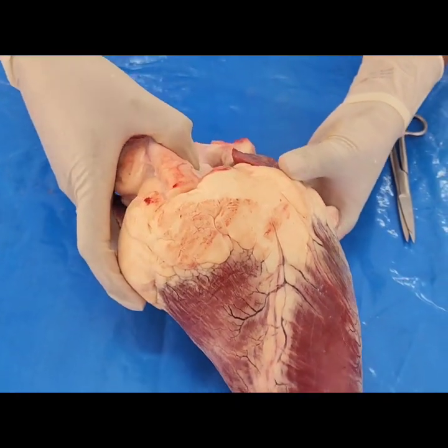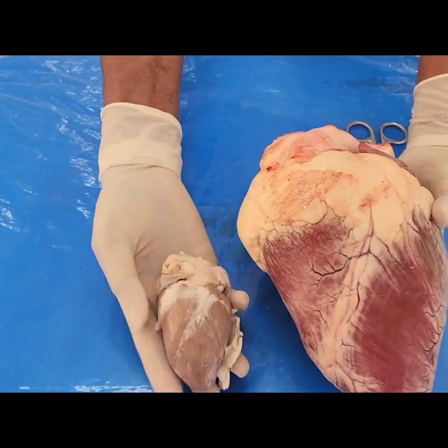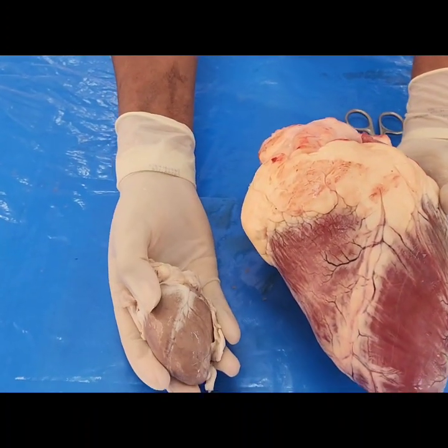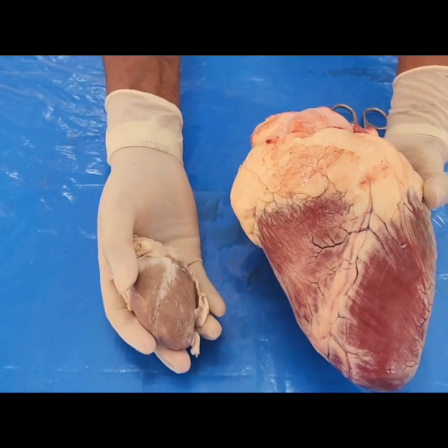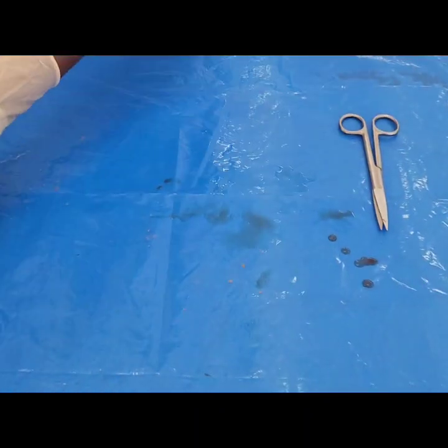Heart of the beef. So this is how huge it is. So this is the shape of the goat's heart, and this is the beef's heart. So this is the shape of the heart.